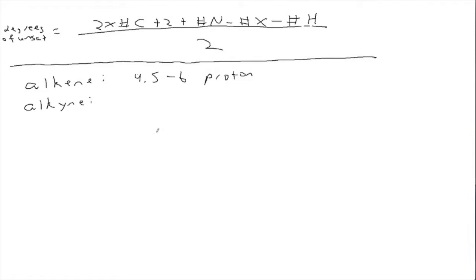What would it be? Like 2.5. You can see that from the Proton NMR. That's right. But that's not going to be the most useful because there's other things in the 2.5 region, right? So how about from the IR spectroscopy? Alkynes in the IR spectroscopy tend to be around the 2000s to 2200s. So that would be the most useful because that would be more distinctive.